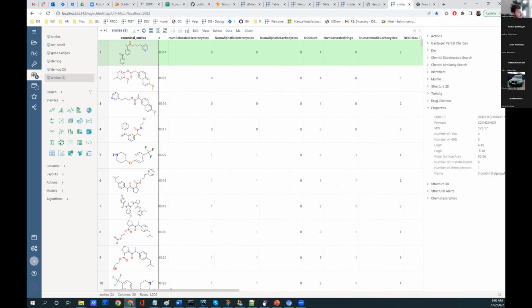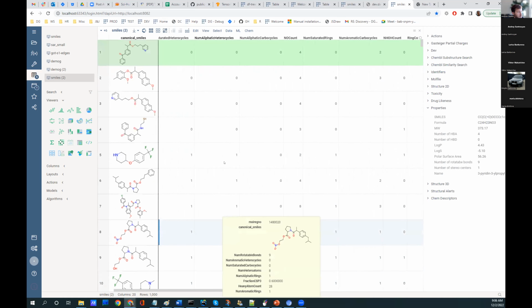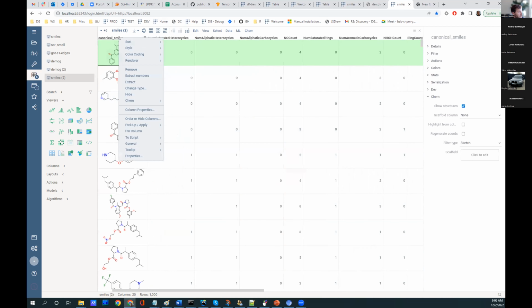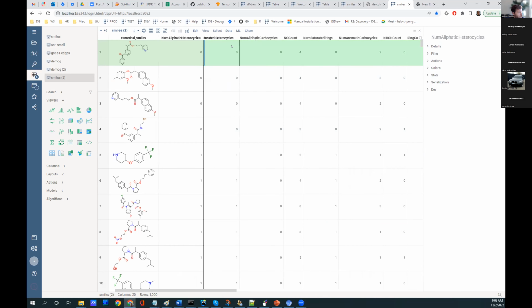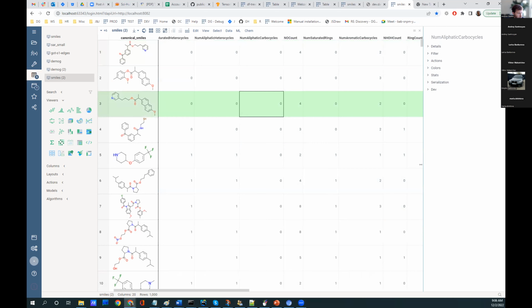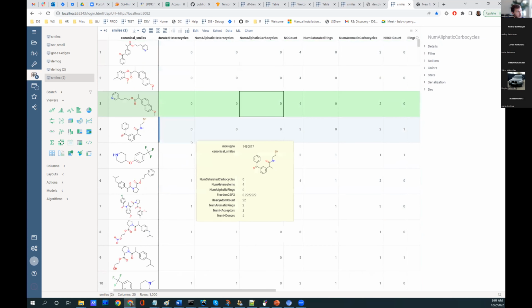That's everything that should be done. After that, the scrolling is seamless. Everything is still synchronized. At any point of time, you can unpin it. Also, it's possible to pin more than one. I'll just select them, choose pin. It works like that. And then you can unpin either individual ones or all of them. This information will get saved in a layout. So if you save it as a project or a cell layout, it will get reapplied.